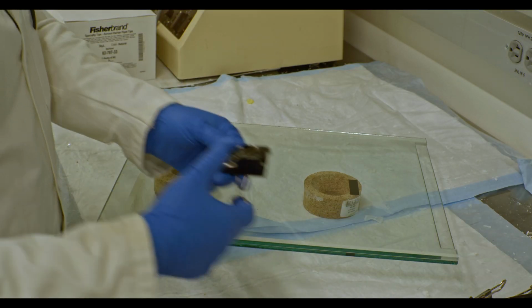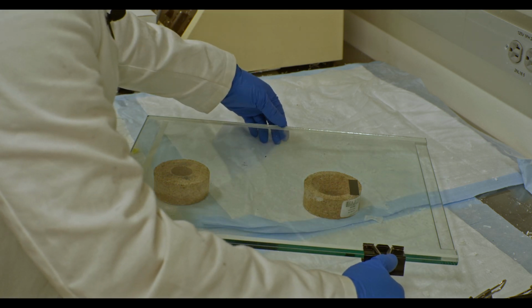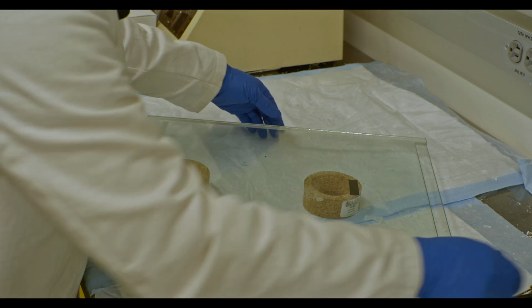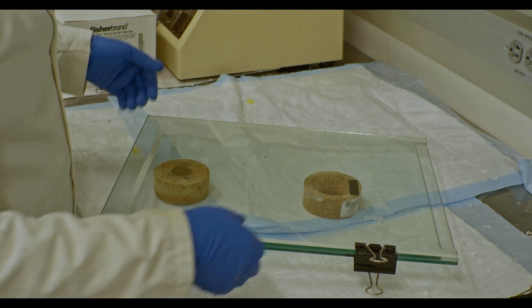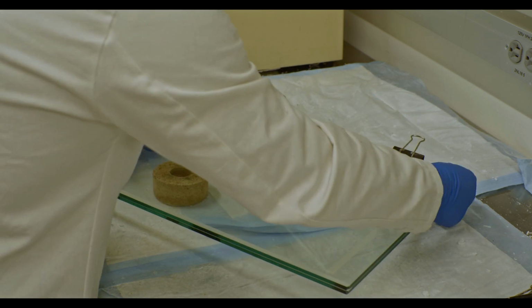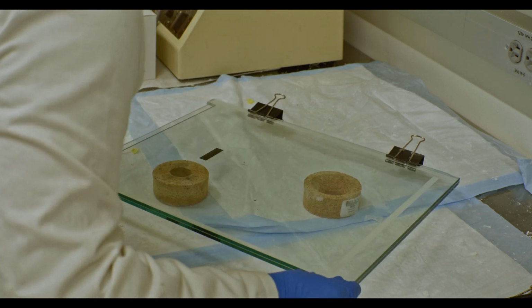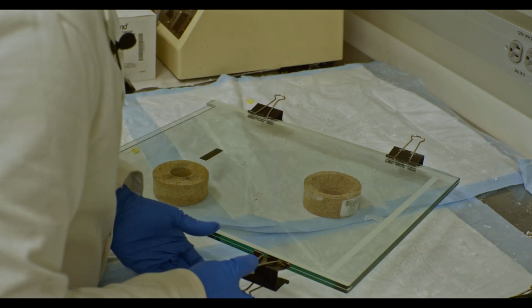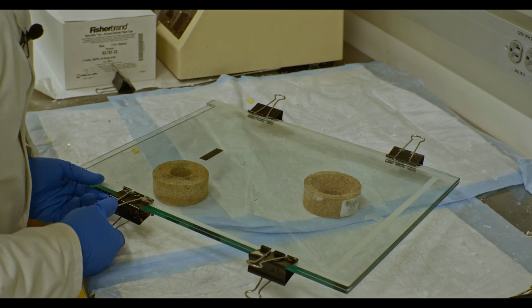The next step is that you want to use these clamps. So these clamps can be used right here, somewhere a quarter of the way, both on the top and the bottom of these gel plates. And this will help hold those spacers in place and the whole apparatus while you construct your gel. You just want to make sure that they don't move too much.